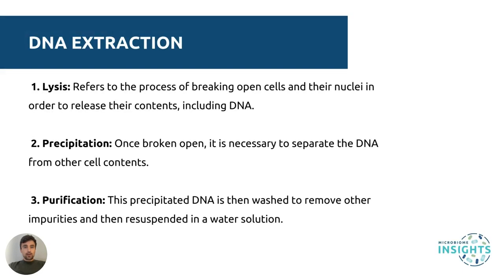Now that we have our samples ready, the next step is extracting the DNA. This involves several sub-steps that are essential to ensure a clean extraction of microbial DNA. The first is lysis. This is the first step where cells are broken open to release their contents, including the DNA. This is conducted using both mechanical and chemical measures.